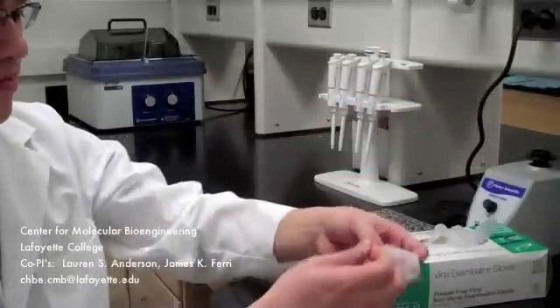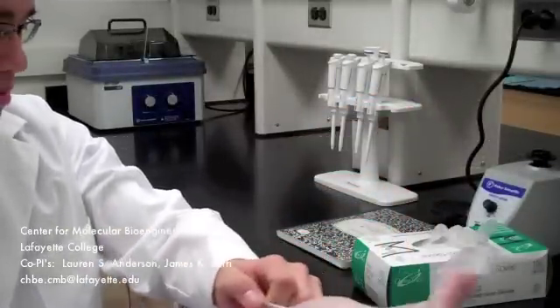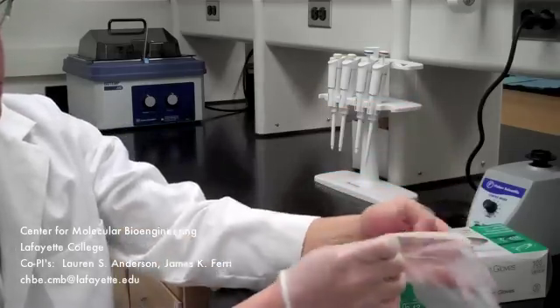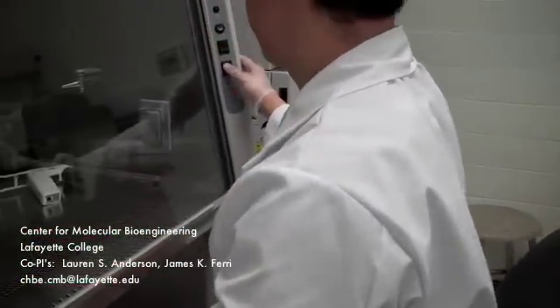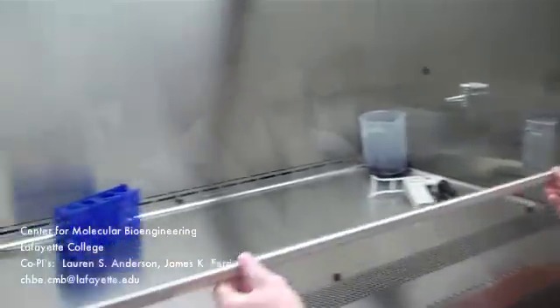Once the media has warmed up to the appropriate temperature, begin by preparing the biosafety cabinet. Before working in the biosafety cabinet, make sure you are wearing a laboratory coat and gloves. Make sure the blower switch and light switch are both turned on and raise the sash to the marked level line.